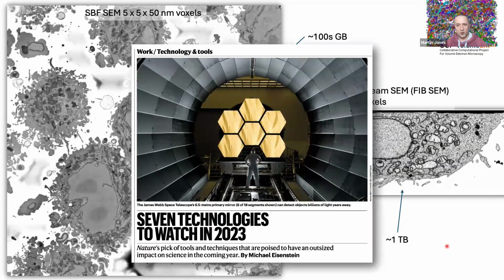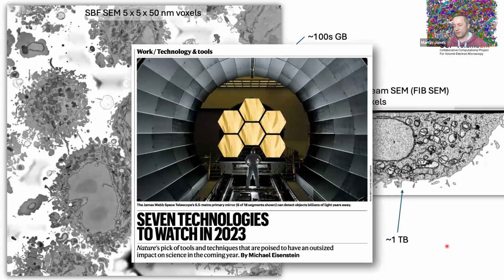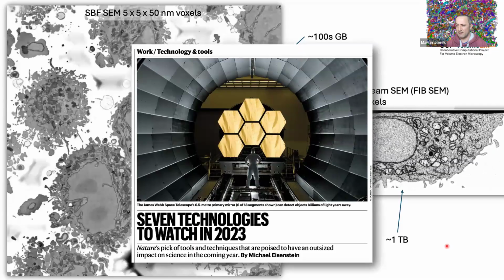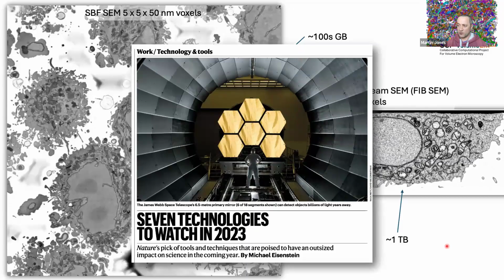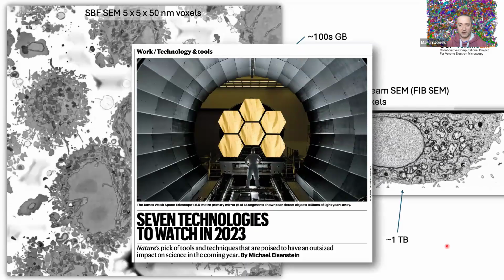And in recent years, volume EM has become a very hot topic. So a few years ago now, it was one of Nature's 7 technologies to watch alongside the James Webb Space Telescope.